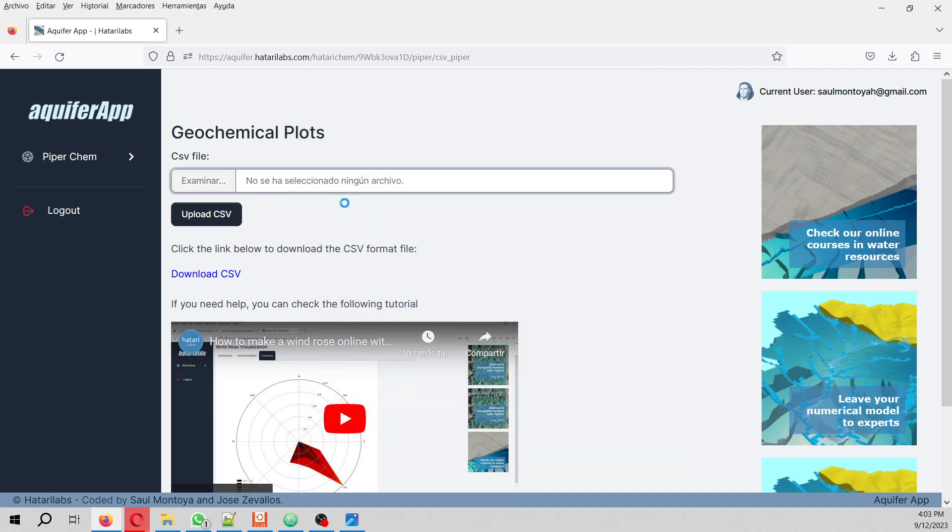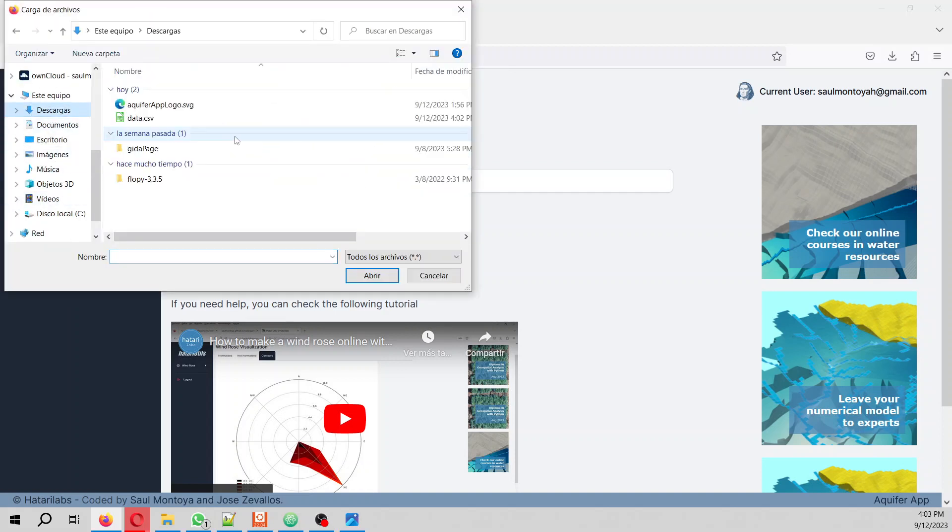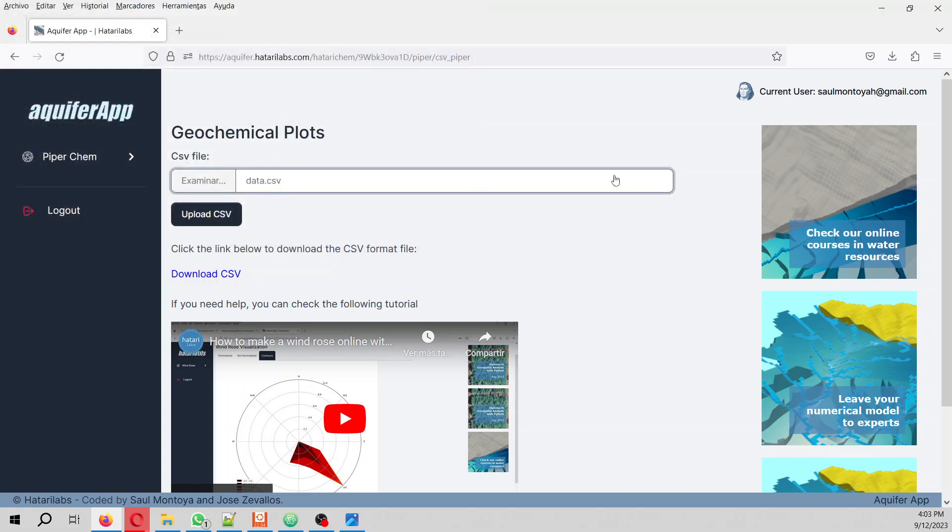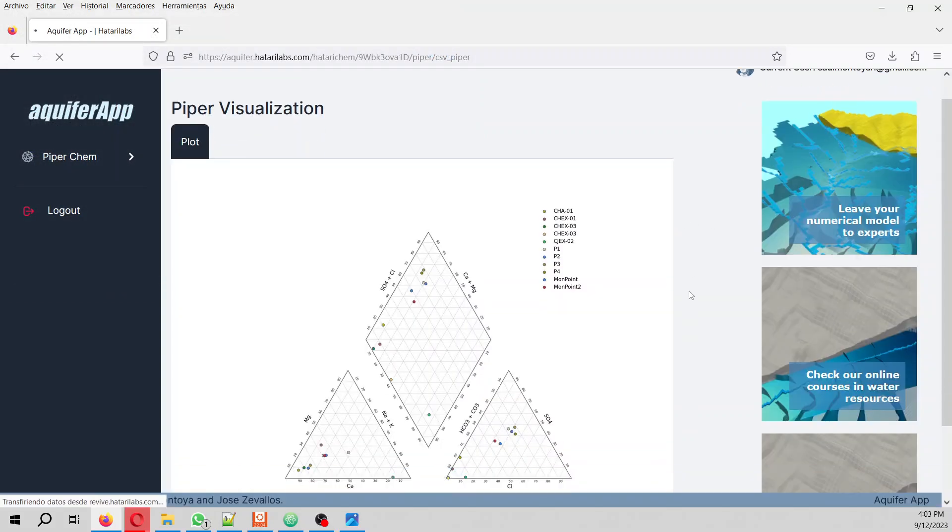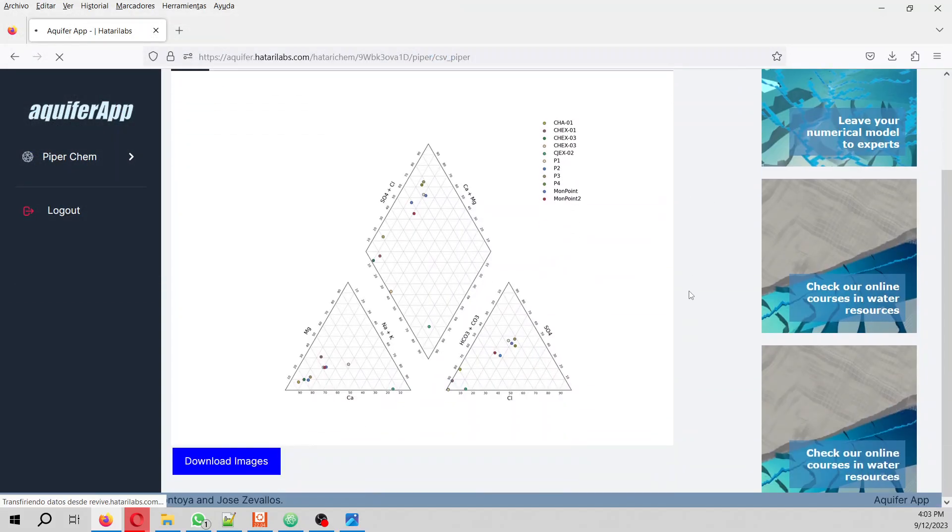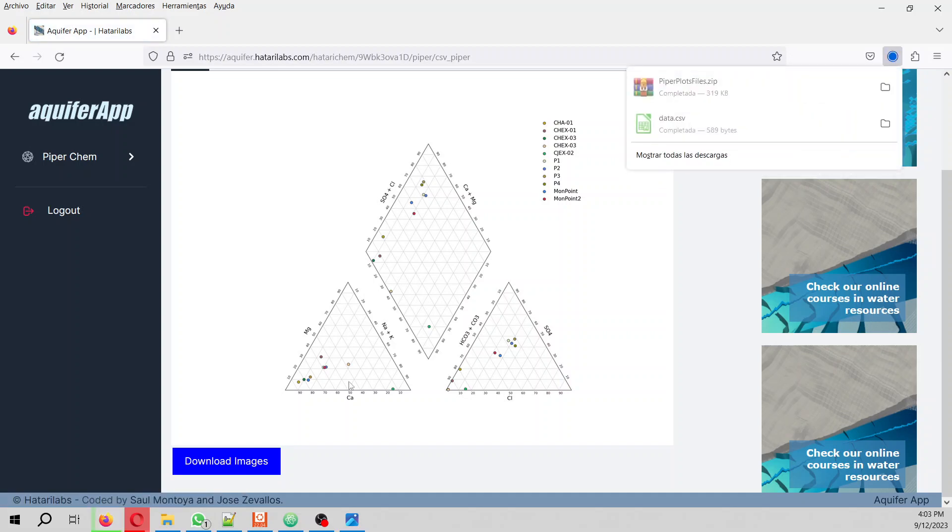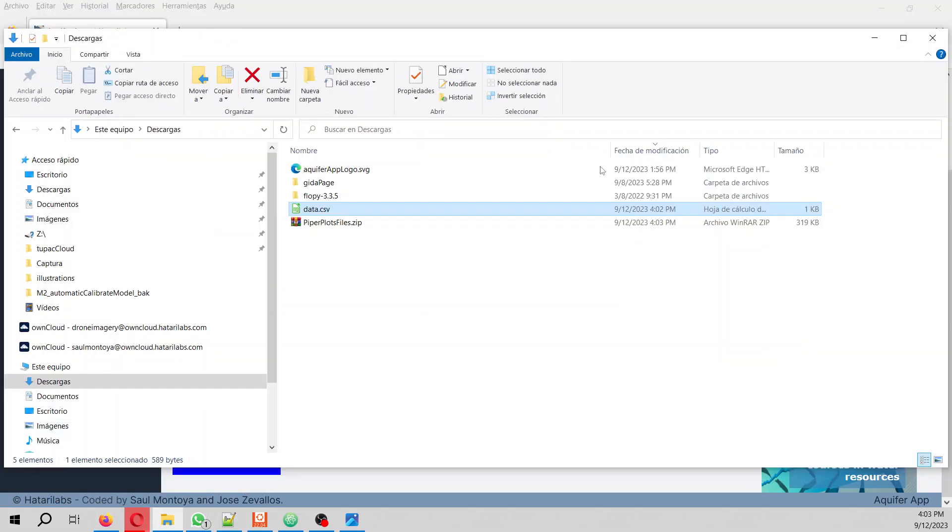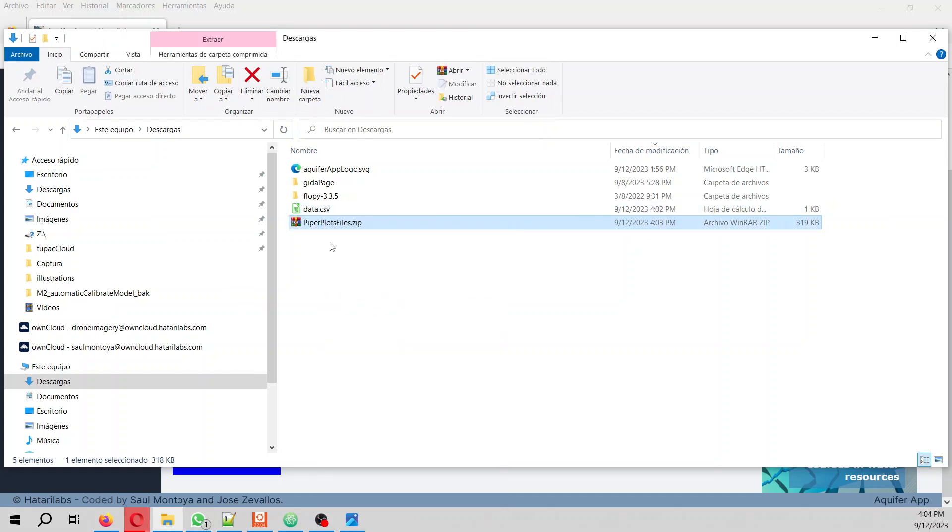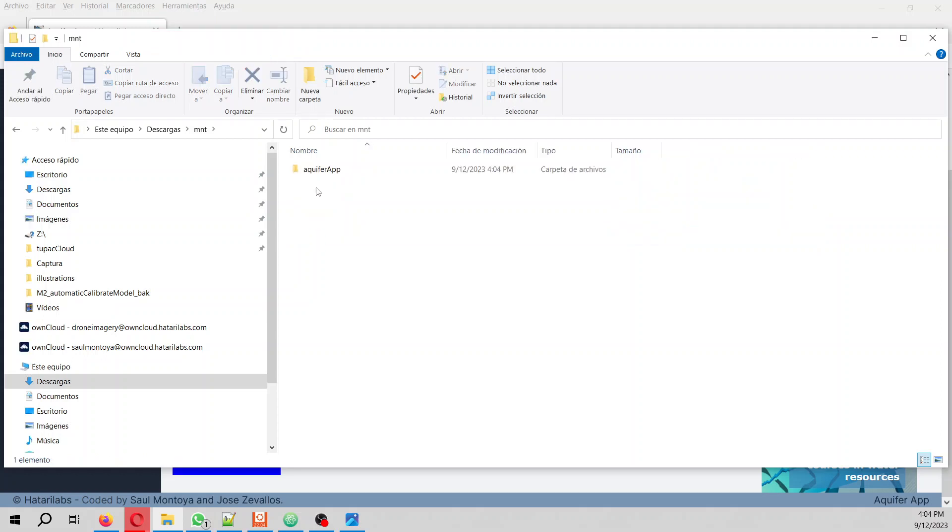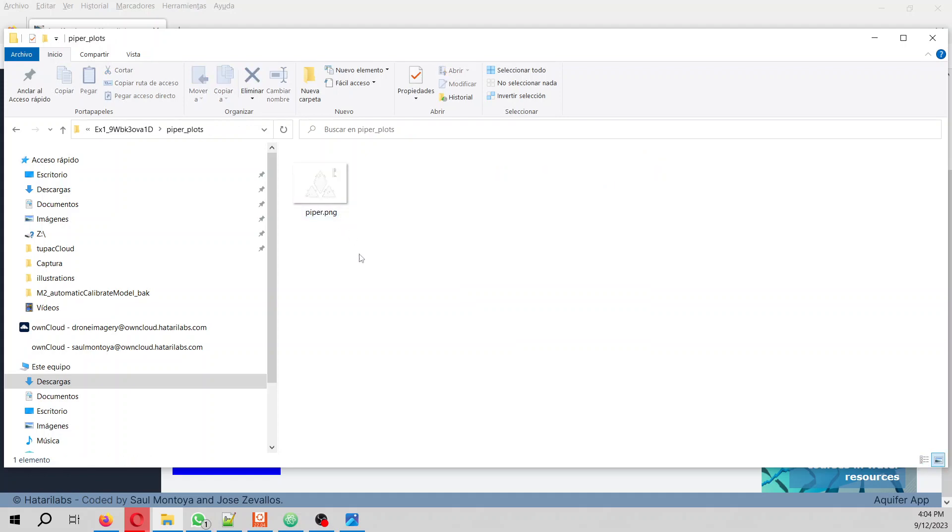you upload that to the Aquifer App. This is the Piper plot - these are the sample names and this is the Piper diagram. If you want to download this, you can download the Piper plot here. You uncompress it, you extract it. This will give you the file and the proper plot.